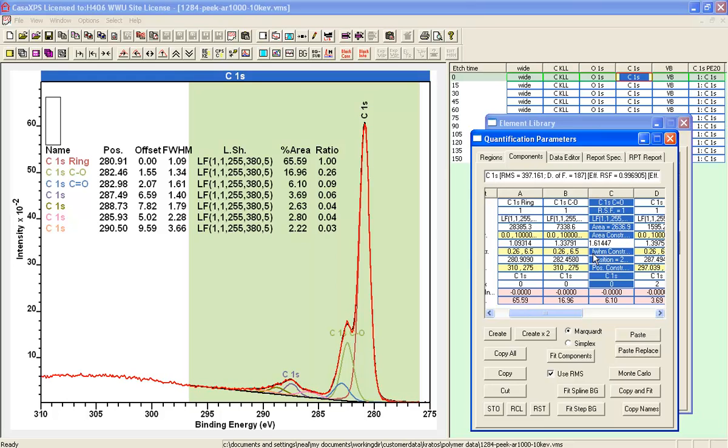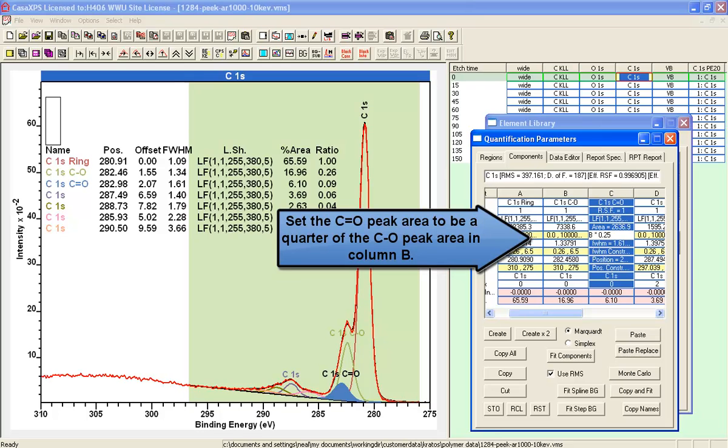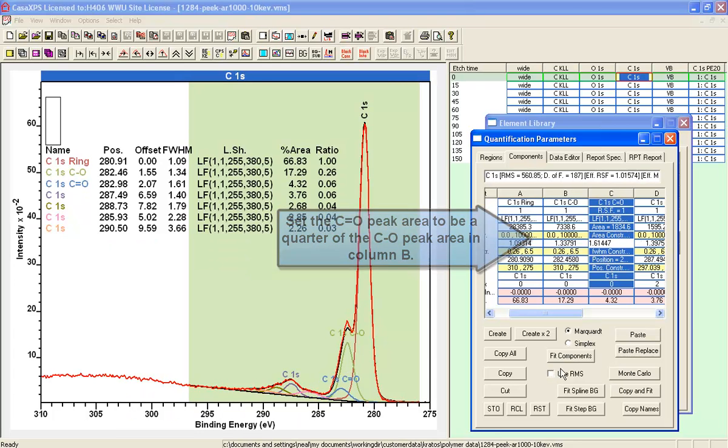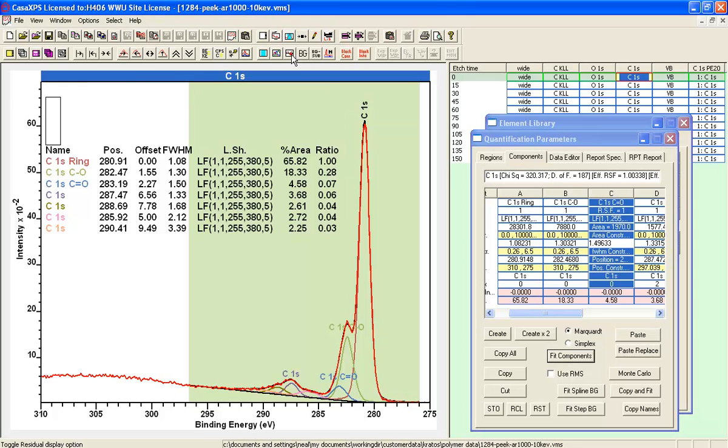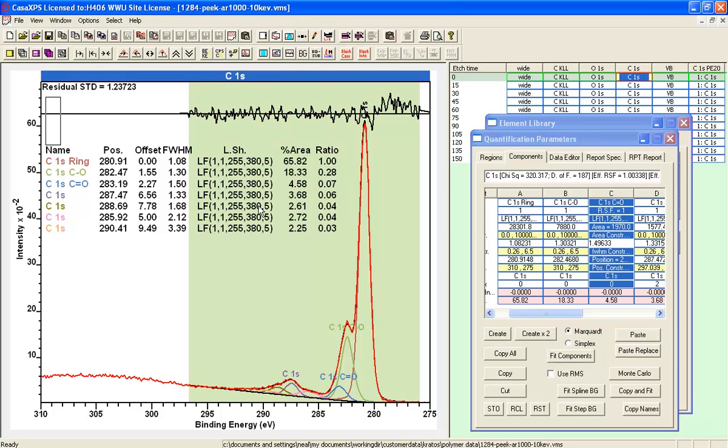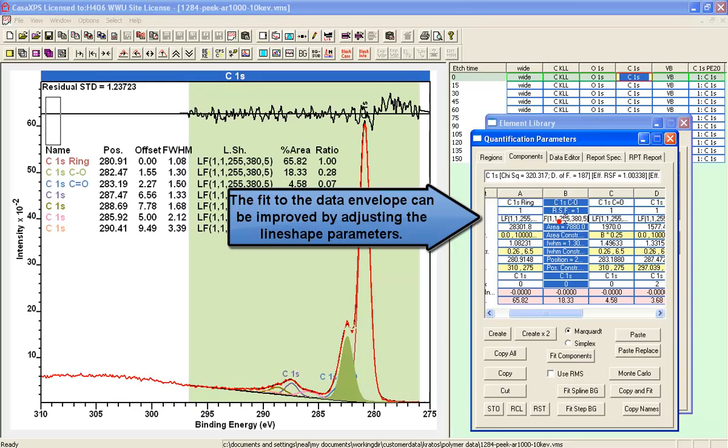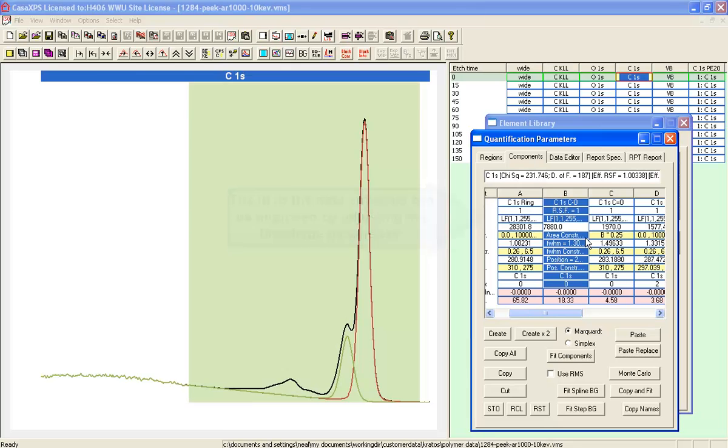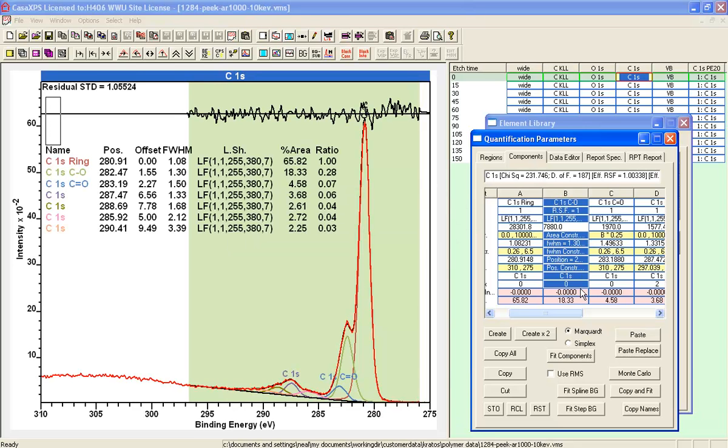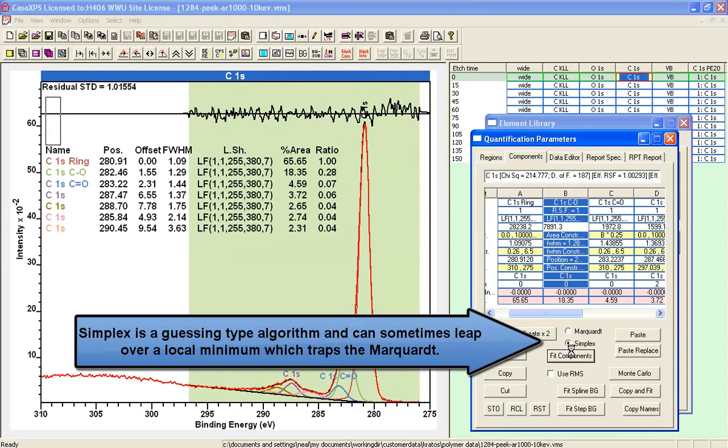Let's set the constraint for the doubly bonded versus the singly bonded so that we get the expected ratio for at least two of these peaks in this three primary peaks within the peak model. Having done that, we would now like to make a little adjustment to the line shape to improve the fit.